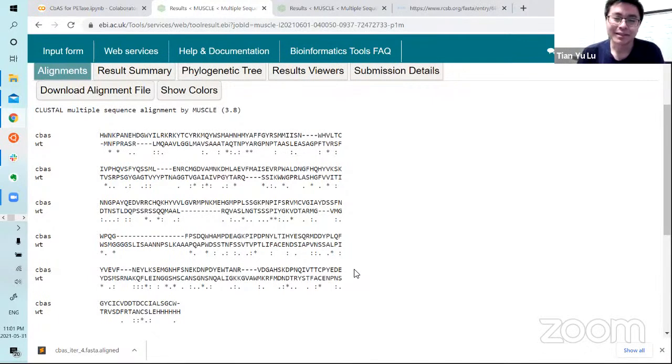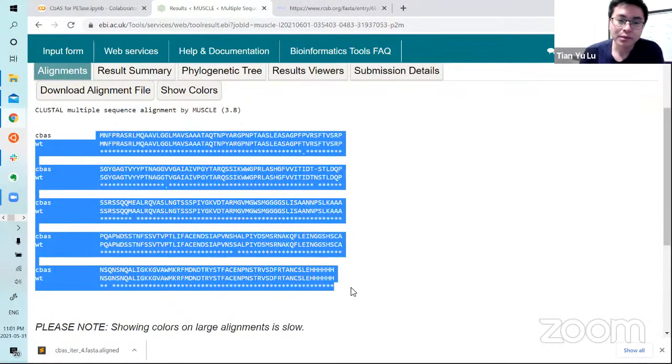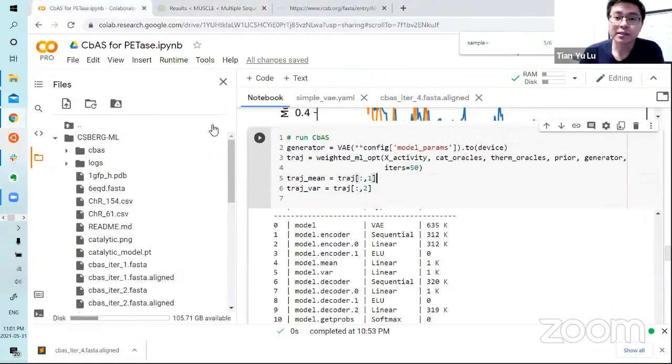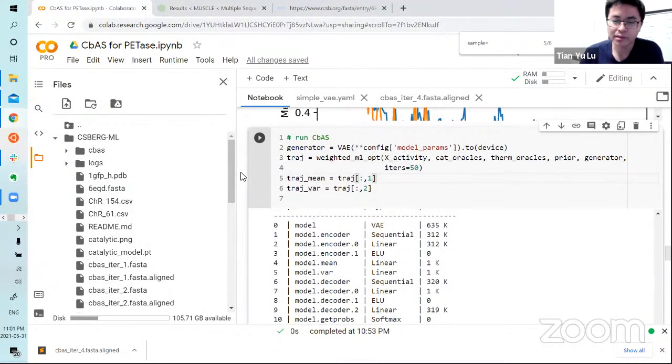Certainly these are not the ones that we should trust. This is probably the more promising one. I kind of like where this is headed, because you can control it. Right now you've got 1, 2, 3, 4, 5, actually 6 mutations. That's fairly controllable, and it's not a trivial thing to pick those positions. So I think this is fine.